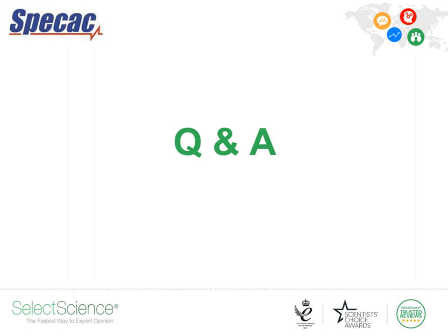Can you comment on an XRF sample prep technique for plastic pellets, which are usually hard at room temperature and melt at much higher temperatures? There are a large number of ways that you could probably do this, and I think it's probably better if we discuss this offline. So I will email you a fuller answer to this. But I think the strategy would depend on exactly which pellet you're using and on its melting point.